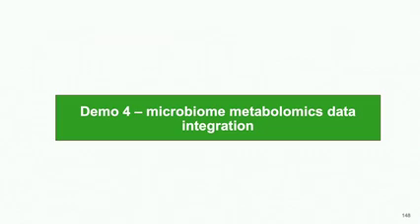The tool is, when you do the data analysis, you upload the data, but how you interpret the data is decided by what you think is biologically feasible.